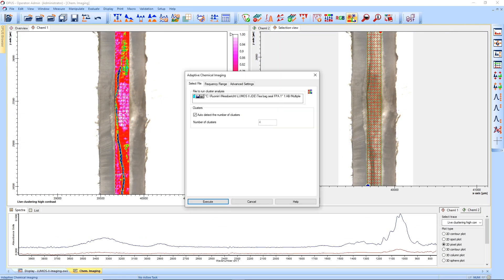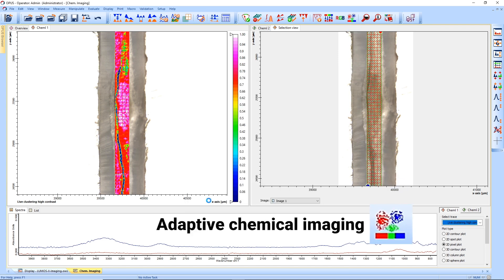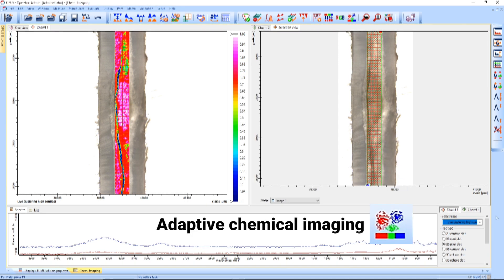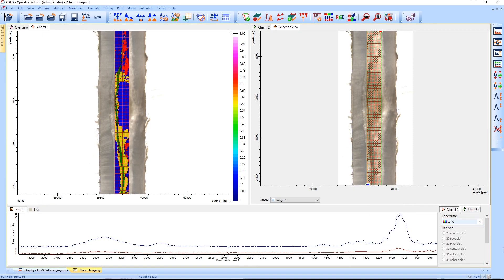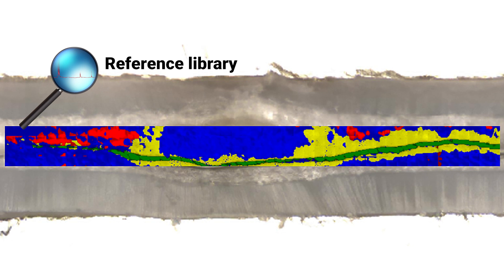Next, we need to interpret this data by using adaptive chemical imaging. With a single click, all the components in the sample are instantly classified. And by using a reference library, the actual ingredients can each be assigned to their spectral signals.